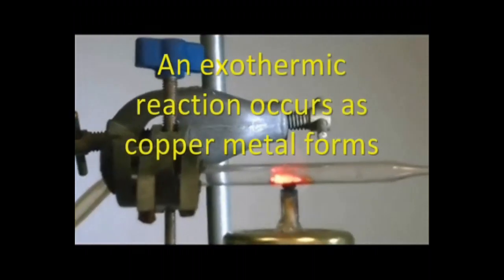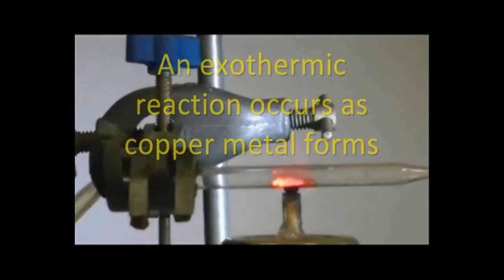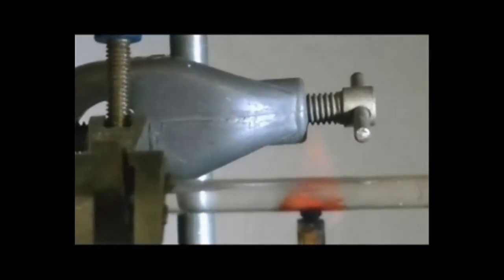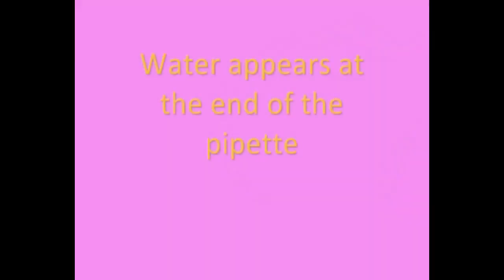I saw that this was an exothermic reaction. Now of course we have copper oxide plus hydrogen and that gives us copper, which you can see, and we should see water at the end of the pipette. And there it is.